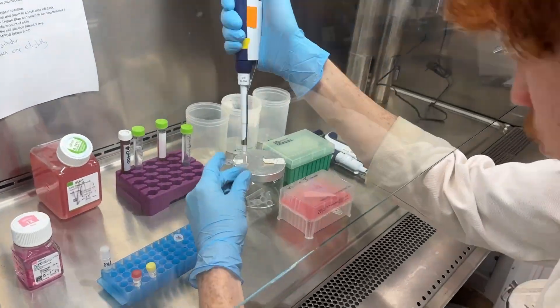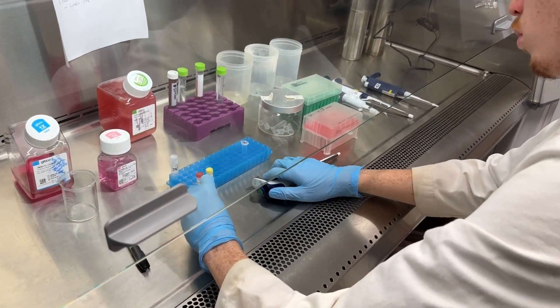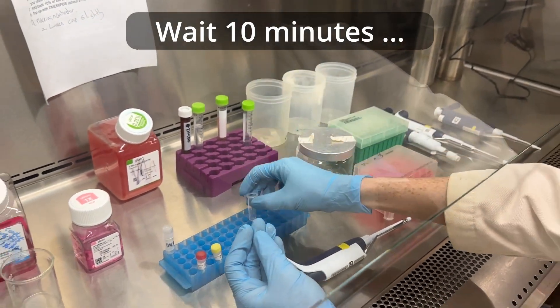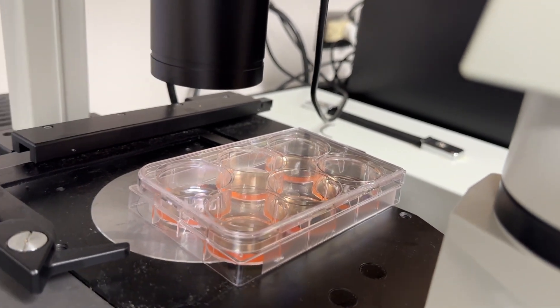Then we combine everything. Each tube has just a little bit more than 50 microliters, so he takes a pipette at 60 microliters and combines the two ingredients. Tap everything down gently, and then we wait ten minutes.